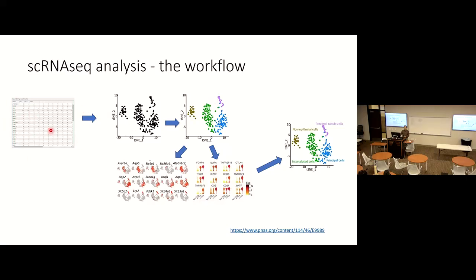So after you reduce the dimension, you don't have to reduce further. You don't even have to see the data. You can do clustering on those cells defined in the 50 PC space. People like to see this type of data because that's for the purpose of publications, for visualization. So we can do this 2D, 3D visualization, and you can use this to do the clustering.